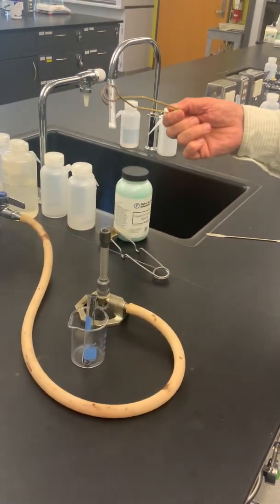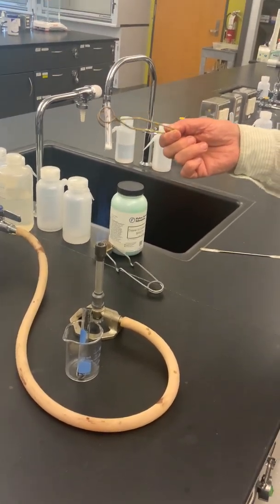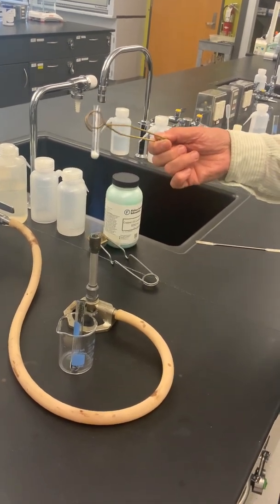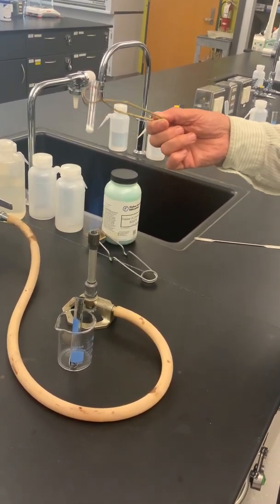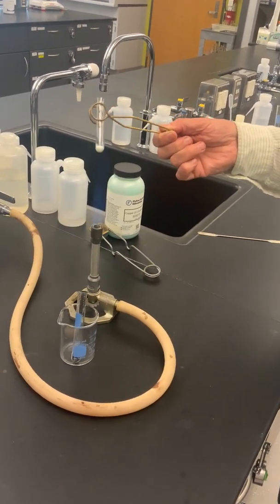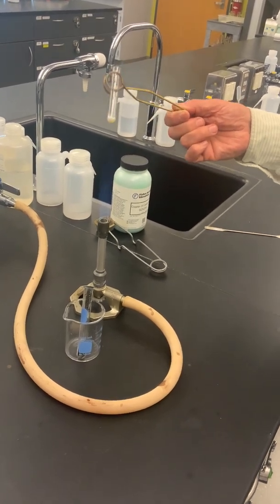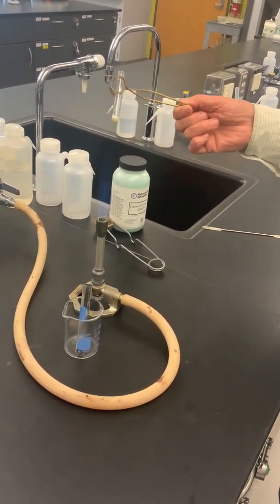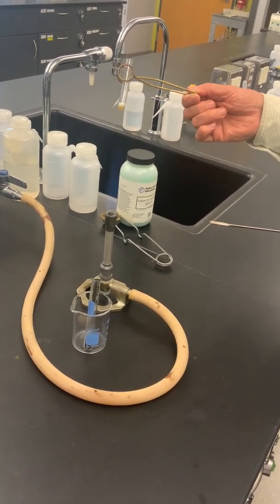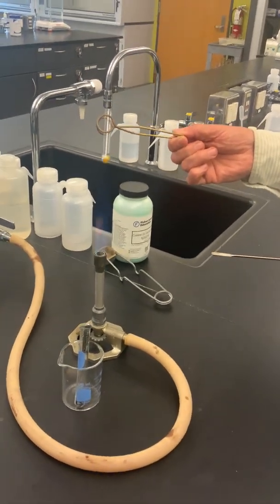This is a tricky one because I want to decompose the sugar, but I do not want to combust the sugar. And if I heat it too strongly, the sugar will actually burn in oxygen. But what I'm trying to do here is a simple decomposition reaction. If you look at your lab, you'll see the chemical formula for sucrose, C12H22O11, and it is then decomposed into simpler substances.